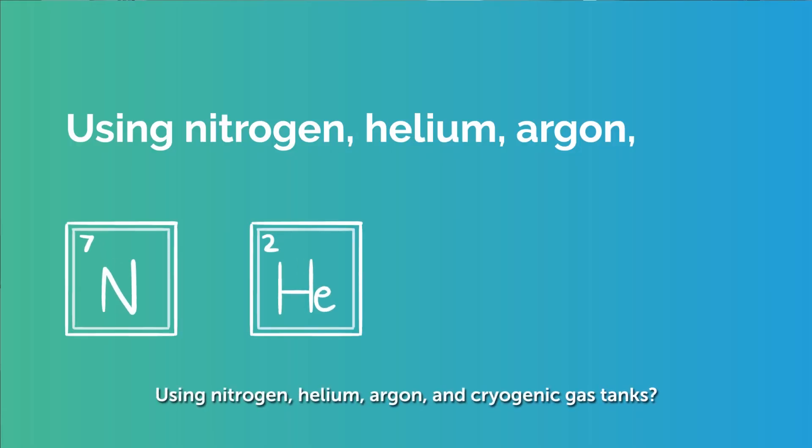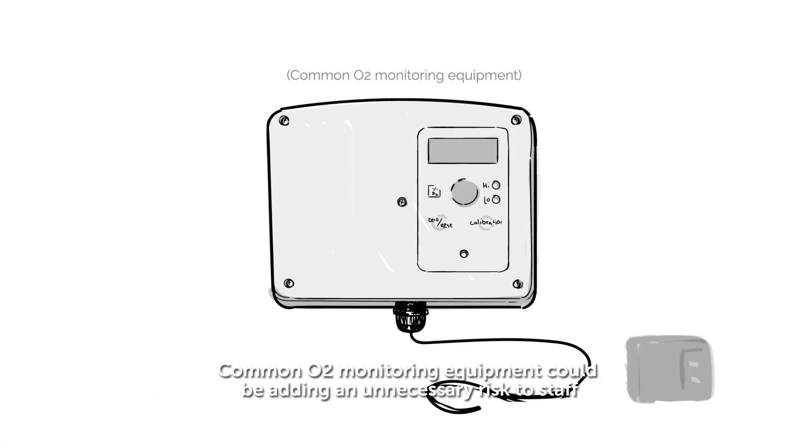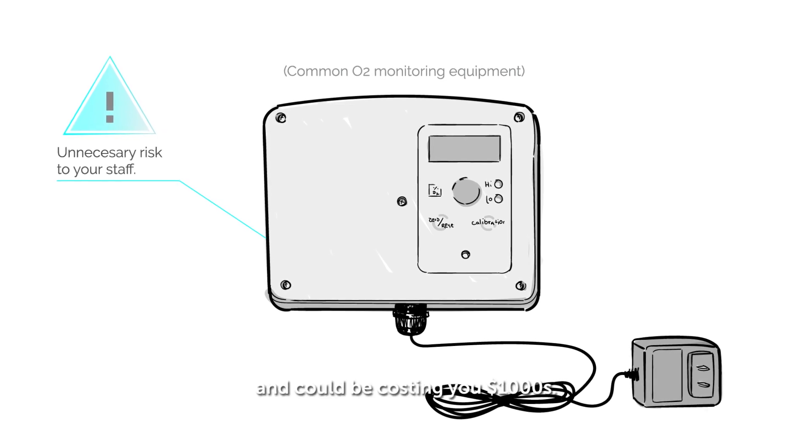Using nitrogen, helium, argon and cryogenic gas tanks, common O2 monitoring equipment could be adding an unnecessary risk to staff and could be costing you thousands.